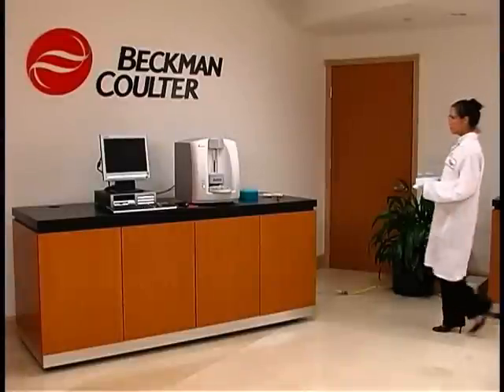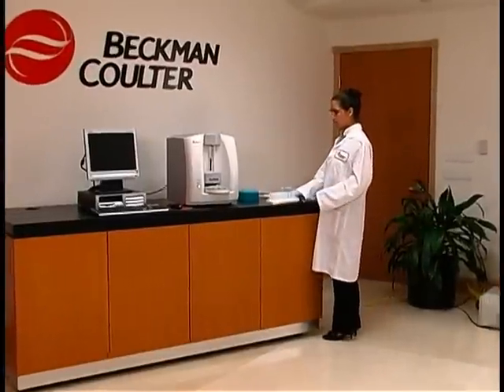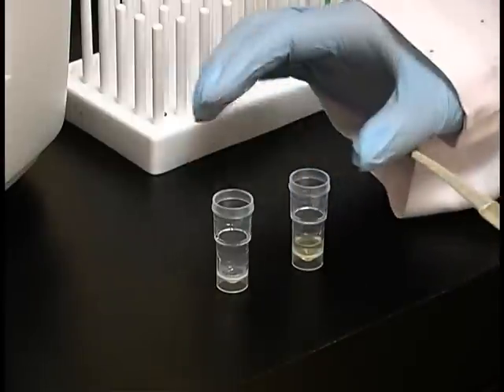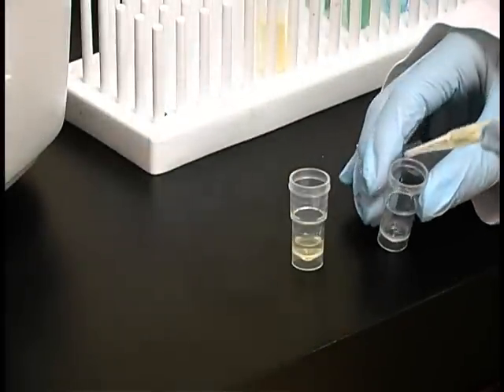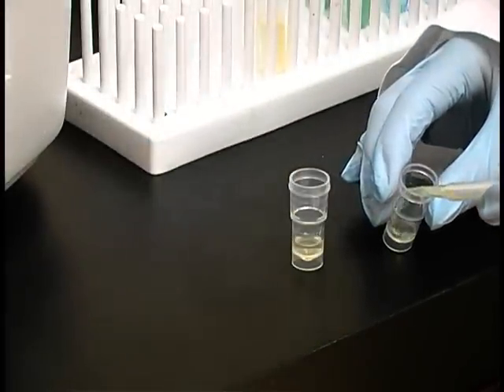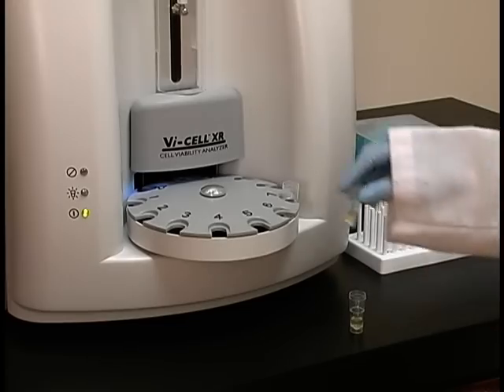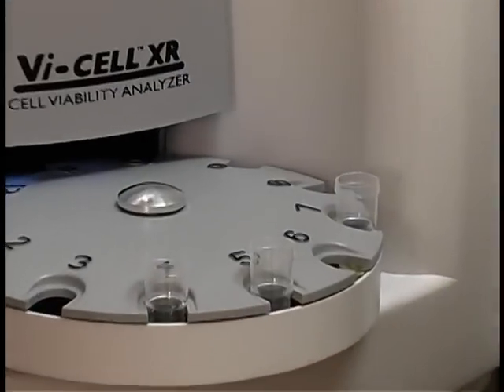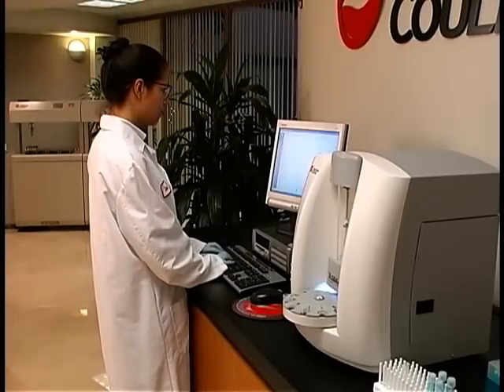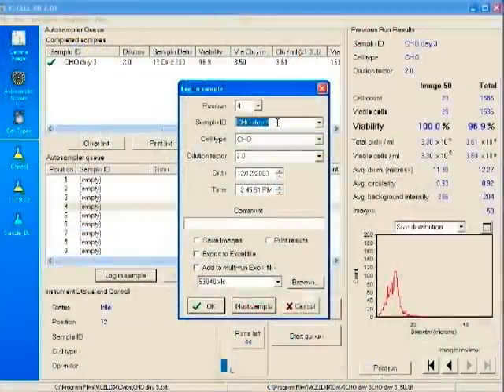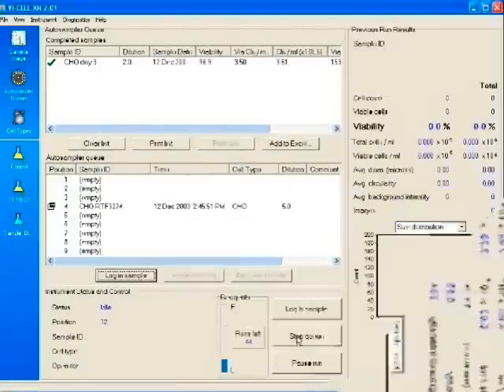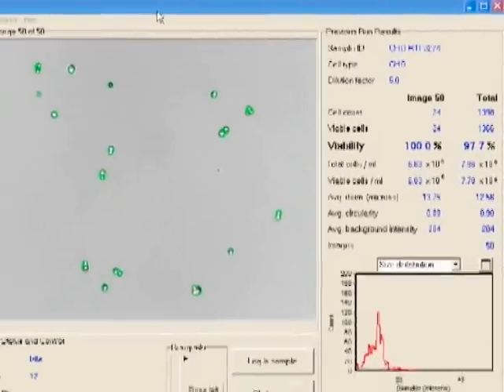The operator's ease of use of the VisCell XR is summarized in three intuitive steps. Step 1: Load your sample, which can be as small as 0.5 milliliters, and place sample cups into the carousel. Step 2: Log in your sample to the user-friendly software interface. Step 3: View your results. It's that simple.